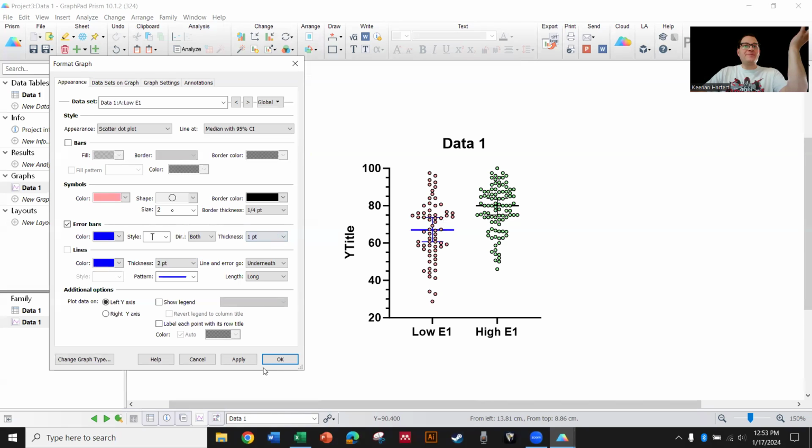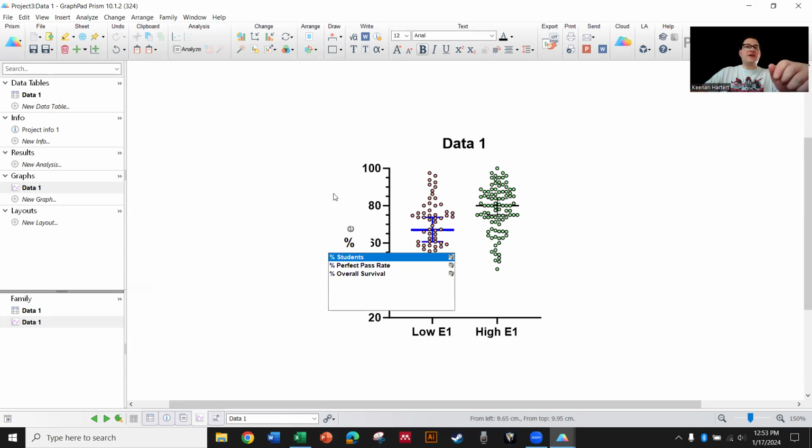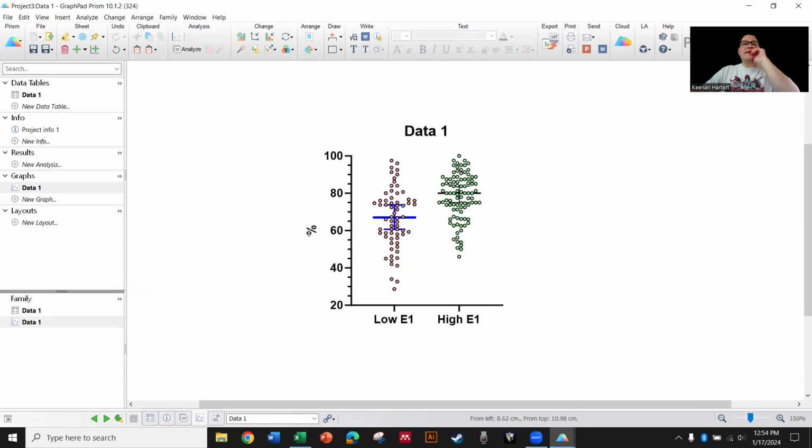To make it more pronounced, you can tell it to go underneath or on top of your data. Most of the time, you're going to want to leave that pretty standard. You can color the data points in a lot of cases, but I'm going to leave it as a hideous testament to what is possible. So I'm going to say exam percent, basically. And I have a caption.